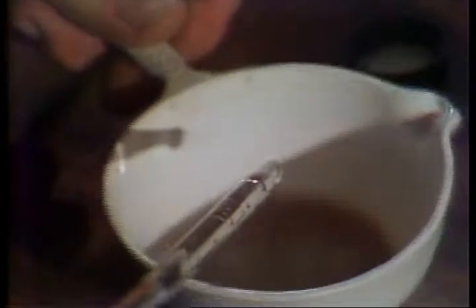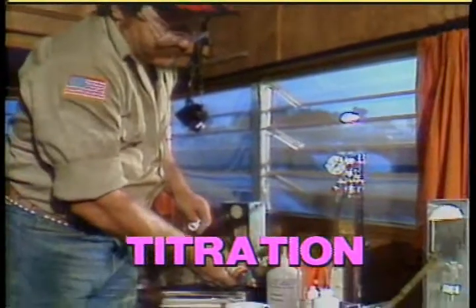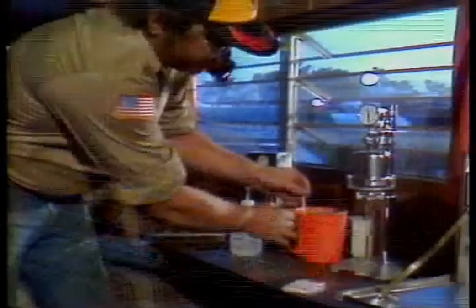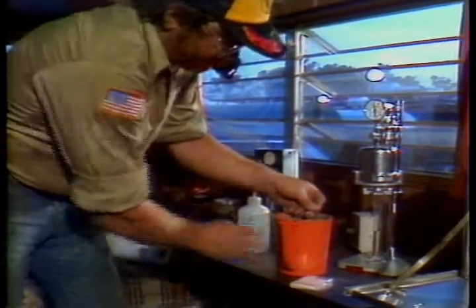These tests are made by using chemicals and a system known as titration tests. They're all done with chemicals and are measured by their chemical reactions. The mud is also tested for its pH level with pH paper. At this point, I check the pH, and on this mud at this range, I'm trying to keep it between 9.0 and 9.5. I came up with a 9.0.